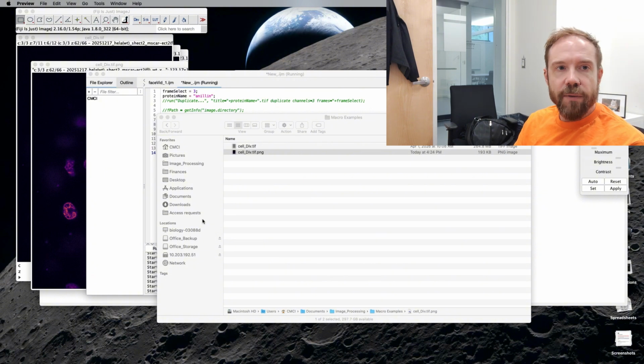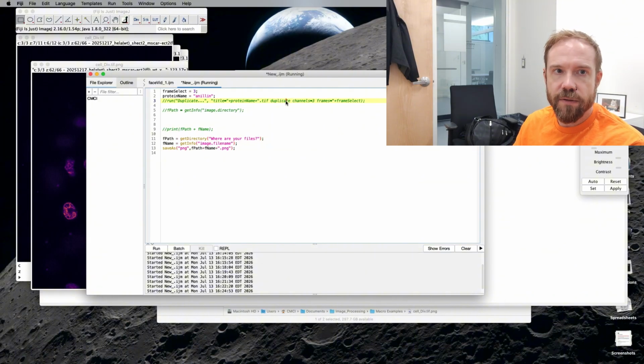Okay, so that was string manipulation. Basically, it's very straightforward. You open and close your quote marks, use pluses, double check your quotes, make sure that your text color is the correct color, because otherwise you're going to be trying to interpret strings as variables and variables as strings. That's the basics of strings, but it's a very good foundation for what we're going to use with strings going forward.